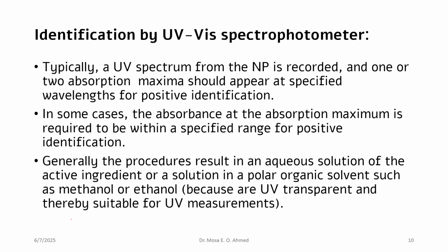For identification of a compound by using a UV spectrophotometer, the spectrum should have the following information.